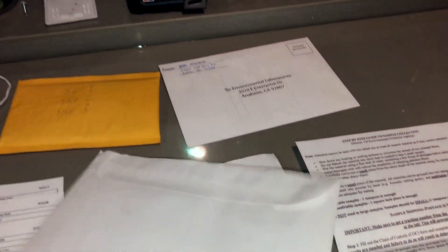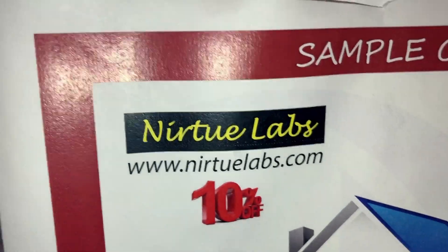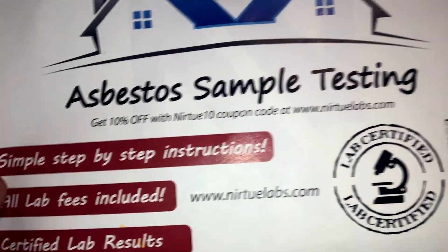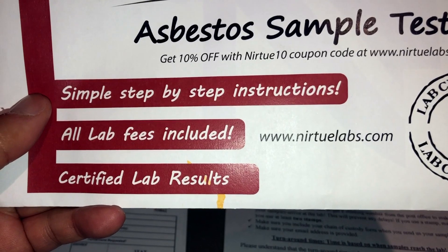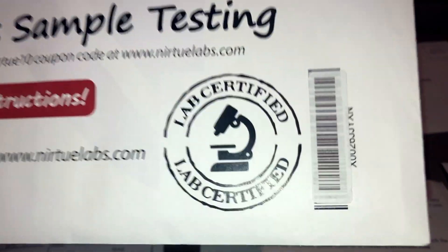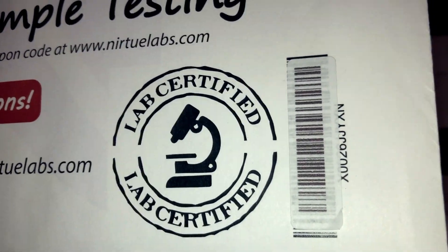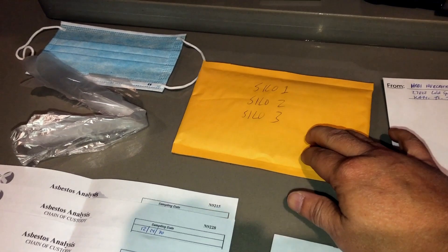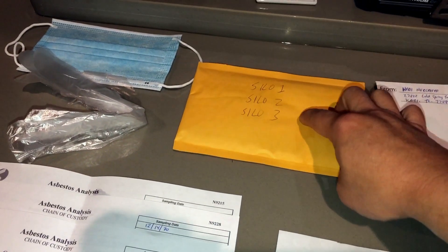My asbestos testing kit came from Amazon in an envelope like this. It's called the Nirtue Labs Sample Collection Kit — Asbestos Sample Testing Kit. It says simple step by step instruction, all lab fees included, certified lab results, and their website is nirtuelabs.com.